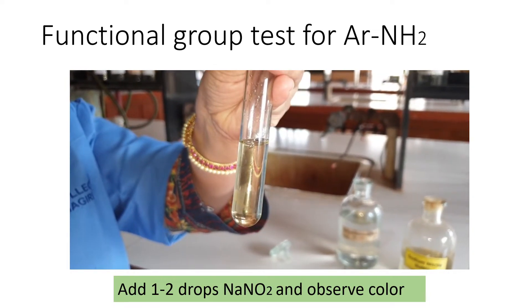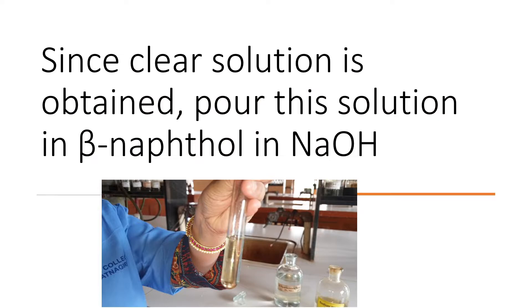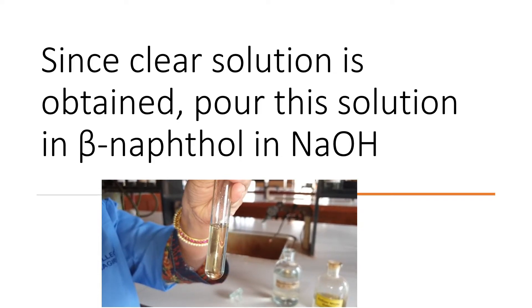After adding NaNO₂, shake the test tube and observe the color. At this point, if the substance is a tertiary amine you will observe red coloration; if the substance is a secondary amine you will observe a yellow oil or precipitate. But as you can see in this case, we have obtained a clear solution.